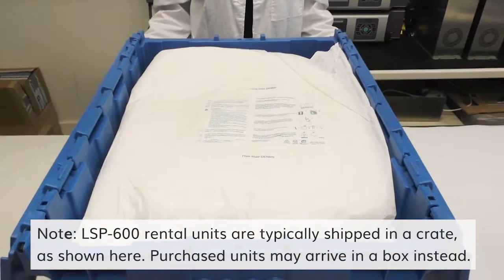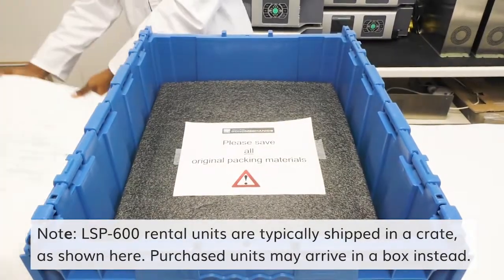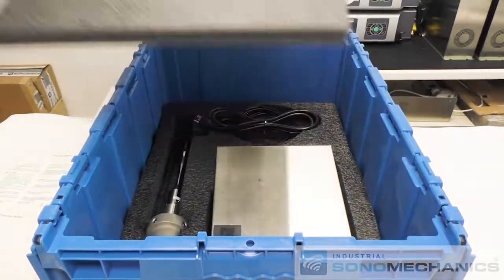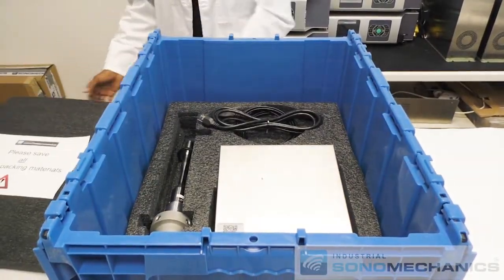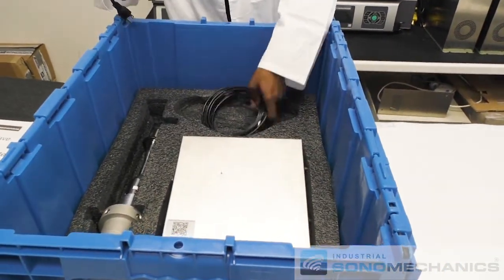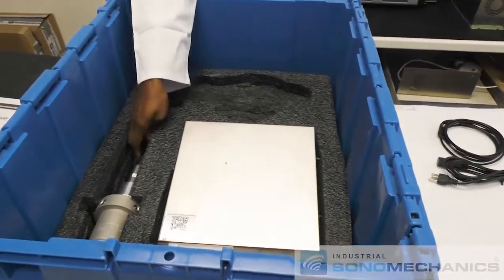To begin, open the crate and remove the white expandable foam as well as the black foam underneath. Be sure to inspect all items for possible damage during transit and to save all packaging materials. Take the power cord, ultrasound cable, ultrasonic stack and generator out of the crate and place them on a workbench.